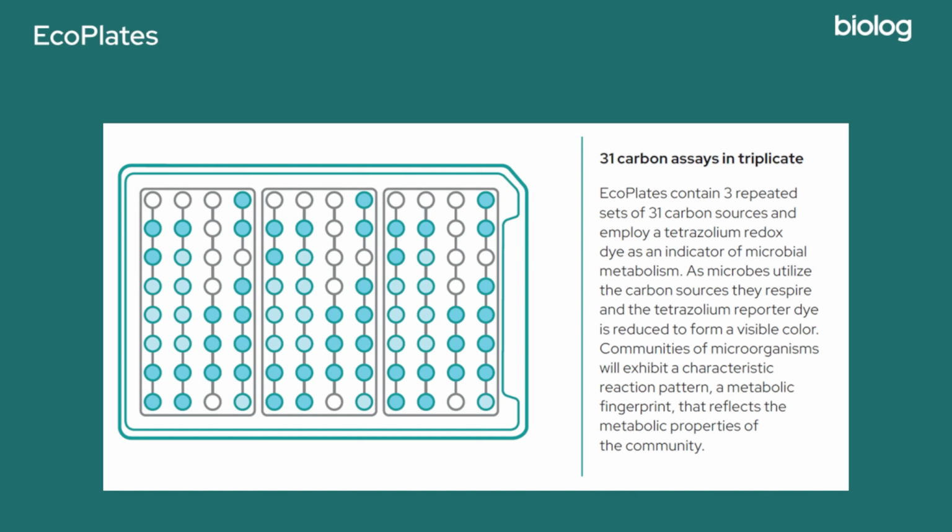The EcoPlate contains 31 unique carbon substrates selected to probe various pathways known to be important to environmental isolates. Odin then takes care of the incubation and the reading, while the software takes care of the analysis.